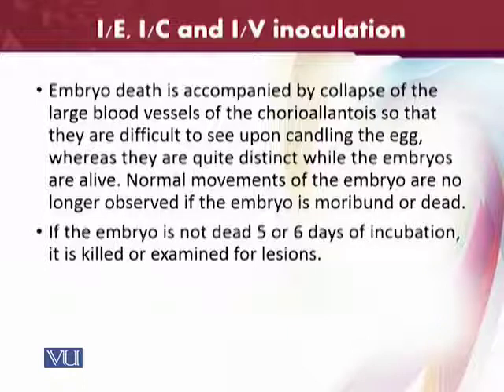So it is very easy to compare a dead embryo with a live embryo. If the embryo dies, the large vessels will collapse and we cannot see the chorioallantoic vessels, while the normal movements of the embryo are no longer observed. Similarly, if the embryo is not dead even after 5 or 6 days of incubation, it is killed experimentally by ourselves, and we can examine the lesions after killing the embryo.